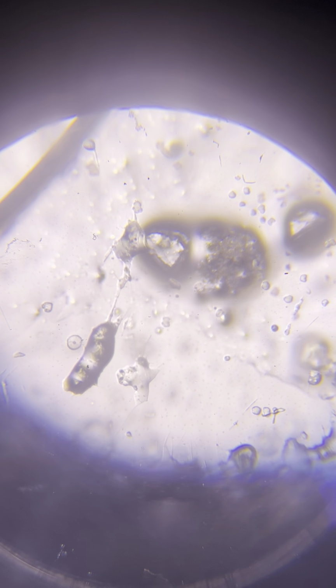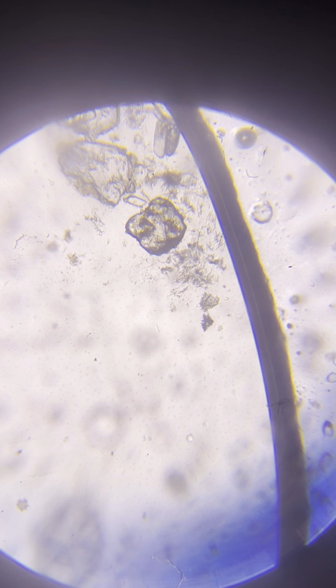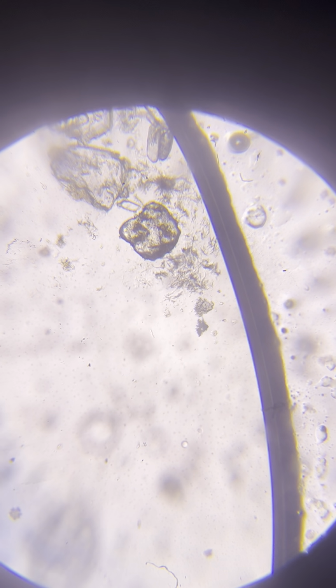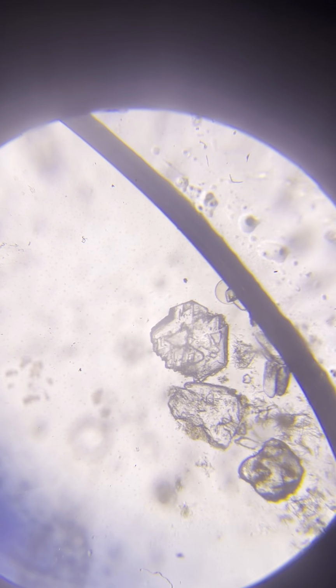Is that a sausage? We haven't seen the sausage bacteria for a while. Do you miss the sausage bacteria? This looks like maybe a huge Nero, I don't know. It's a little bit contoured, but sometimes they are contoured. I just think that what we actually see is like an enterprise class Nero. We've seen such in the past. They are rare, but we've seen such, and this is very exciting to see. I'm almost certain that what we see now is an enterprise class Nero.